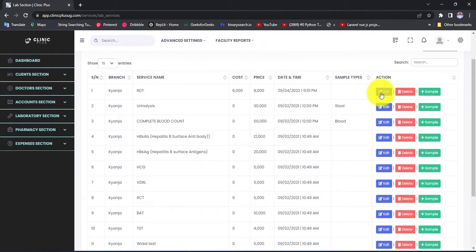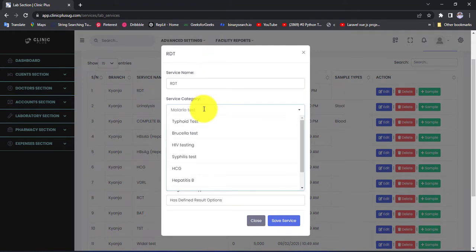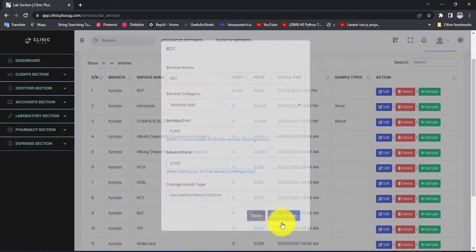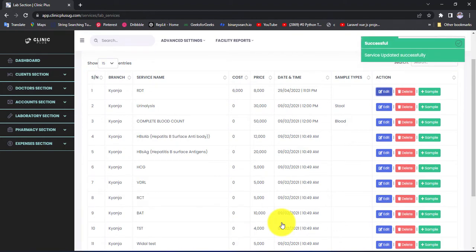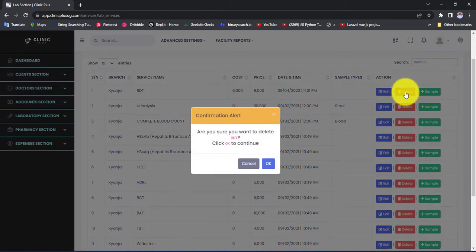After adding a service, if at some point you want to edit it, you can click on the edit button in blue. You can edit the name, the category, or even change the price. After making all your edits, hit the Save Service button and all the edits you have made will be reflected to that service.